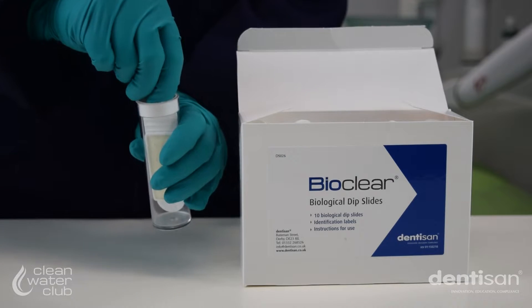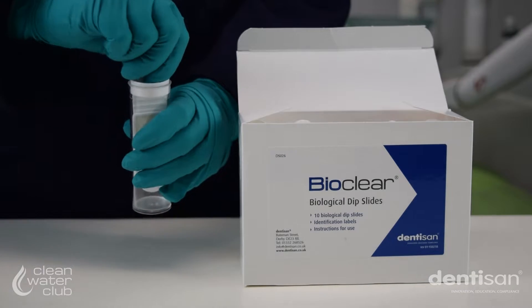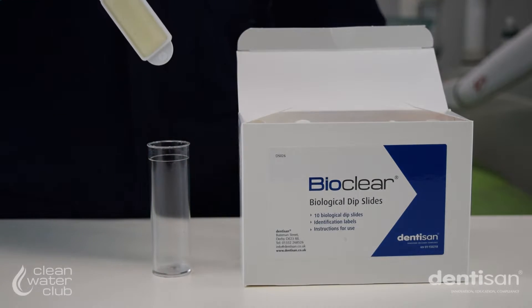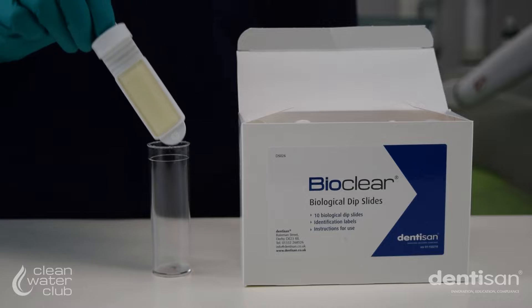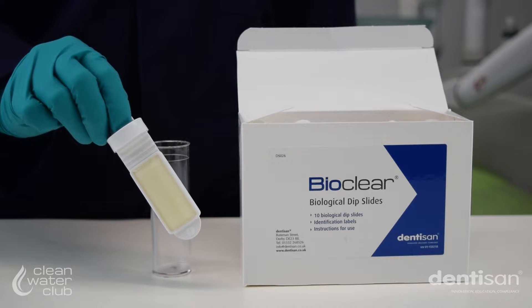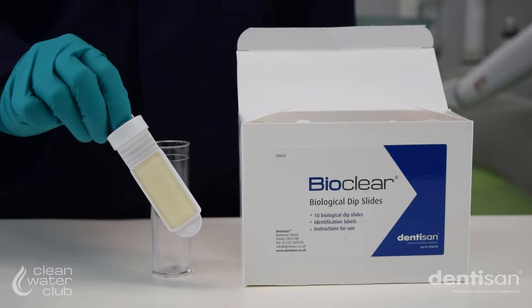Carefully remove the paddle and cap assembly by pulling gently whilst twisting, taking care not to touch the surface of the paddle. If the surface is accidentally touched with a hand or any other object or surface, discard the dip slide and select a fresh one.